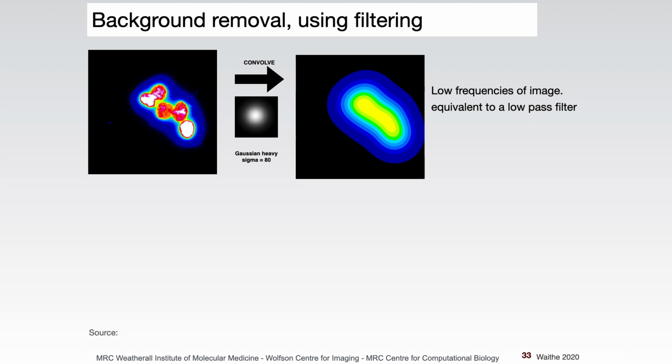And then what you get from this image is a very blurred representation, and this represents the low frequencies in this image. So if you squinted your eyes a lot, this is equivalent to a very strong Gaussian, and you can see that this is kind of the squinted version of this, right? And this is what we call a low pass filter. So we've got rid of all the high frequencies.